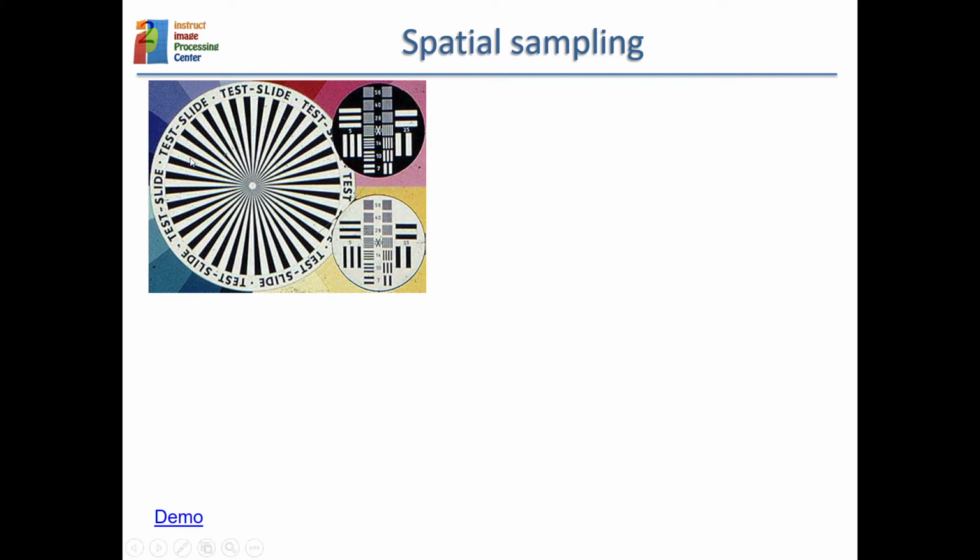But what we see, and the same happens for every circle, is that as you get closer to the center of the pattern, you no longer see the ups and downs. They are there because physically they have been constructed that way, but you cannot see them anymore. So what you see is a kind of blurry area where, instead of black and white alternating, everything is gray.